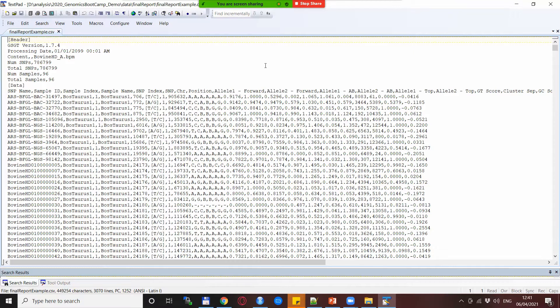In order to clarify a bit more and to see it better I loaded this main part into R so we will discuss it there but basically the columns are exactly the same as shown in this file.